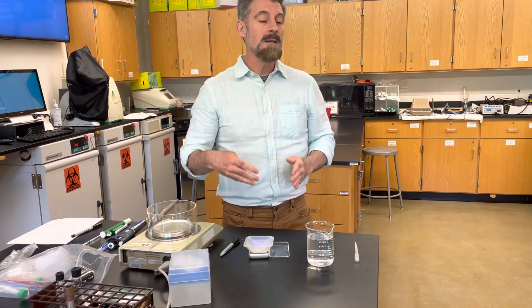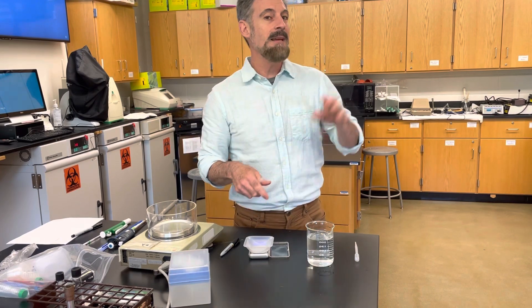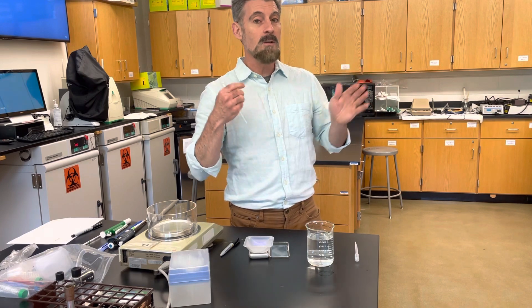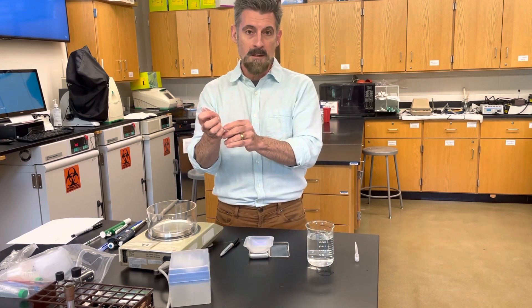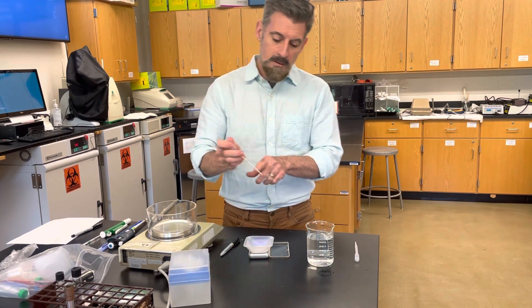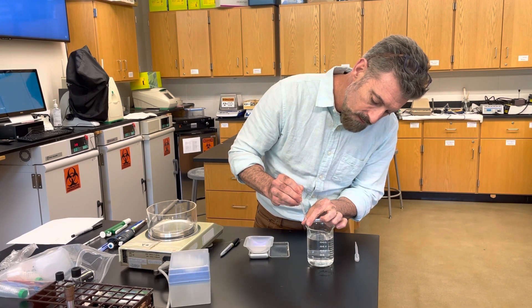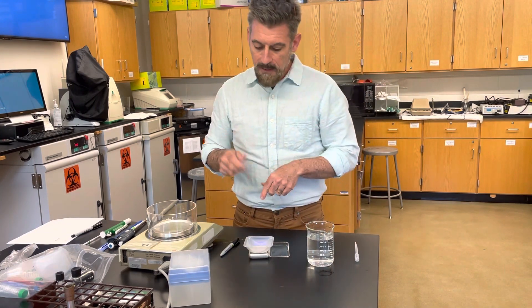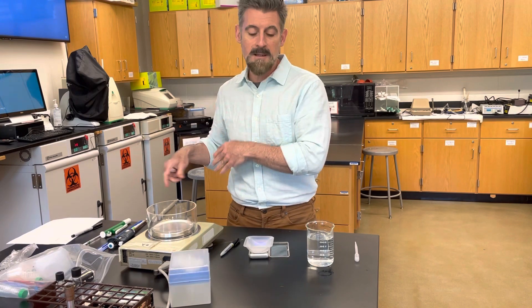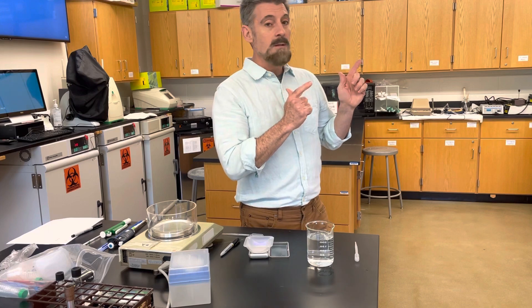You're going to repeat this whole process — both the physical pipetting and recording of data and the calculations — three times with three different volumes. Once you're done with all 10 for the one mil, you start over and do the 0.5, drawing it up just to the 0.5 mark, writing those numbers down 10 times. Then do the three mil the same way. Now I'm going to show you how to do the calculations.